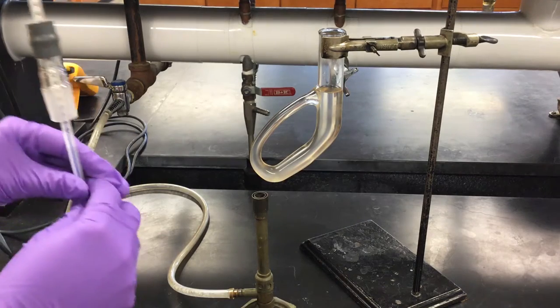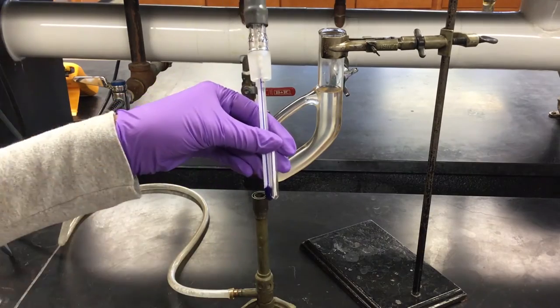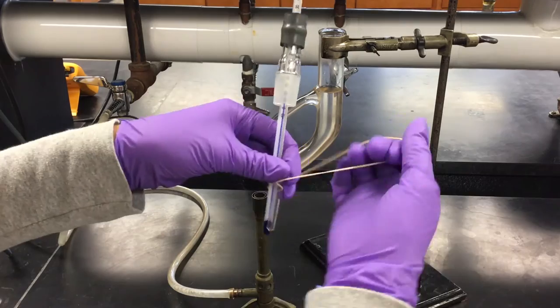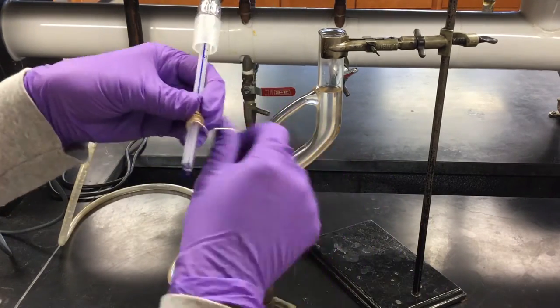You'll want to put your thermometer inside the thermometer adapter and grab one of these small test tubes and a rubber band from the side shelf. Make sure the rubber band is high up on the test tube so that it does not dip into the oil, otherwise it will dissolve and your sample will fall into the oil.